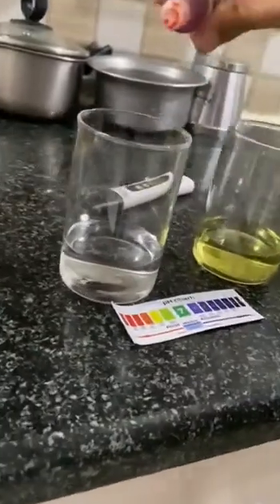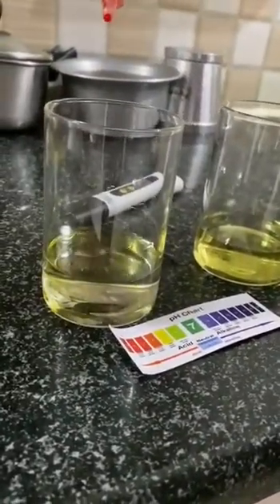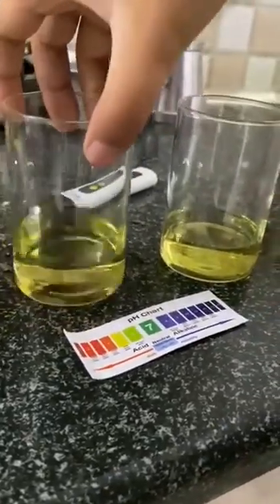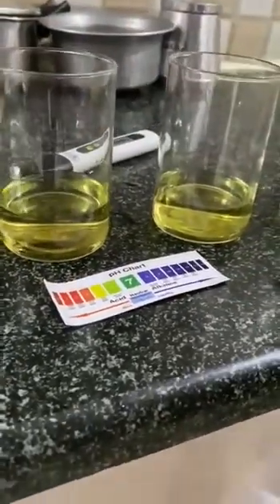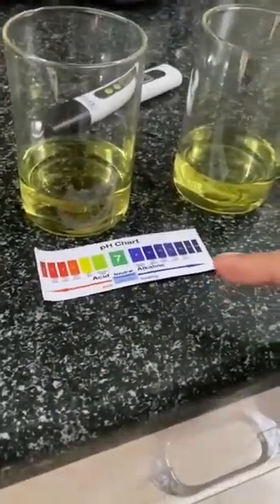Let's check for the copper plus water — adding 1, 2, 3, 4, 5, 6 drops. This is also the same as the previous one. pH looks around 5, between 5 and 6.